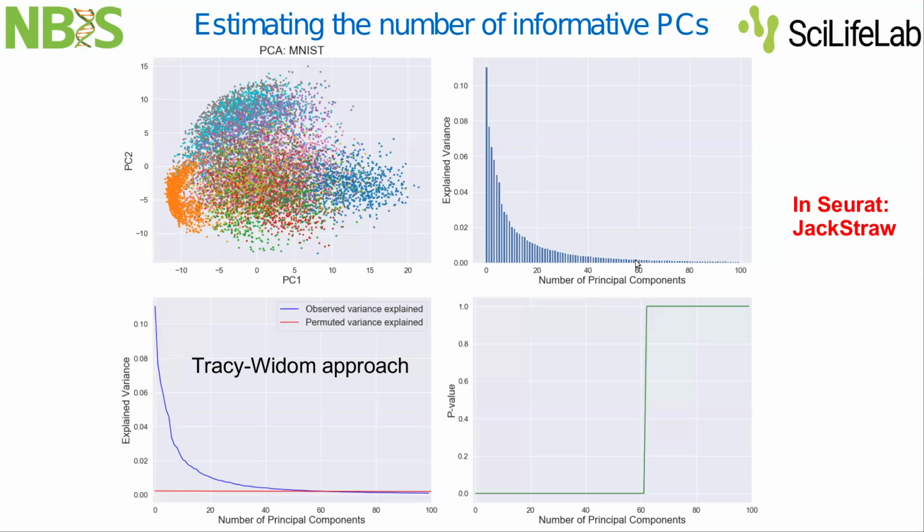And that's one way, what is called the elbow approach, when people just use their intuition and introduce some little bit arbitrary threshold and just drop principal components that explain very little variation. There is another, maybe a little bit more scientific approach.